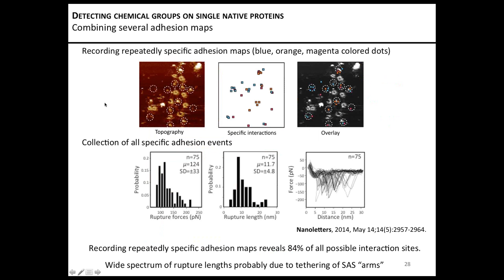As you might have noticed, we didn't record all of the histag interaction sites in the protein. This can have manifold reasons. One of them, of course, is that the contact time is not enough yet. So it can be that the specific interaction between the ligand and receptor hasn't been established yet due to translational and rotational conformations of the ligand. So it didn't really find the histag. Secondly, it could be that these histags of the native protein are facing the mica, so they're not approachable.